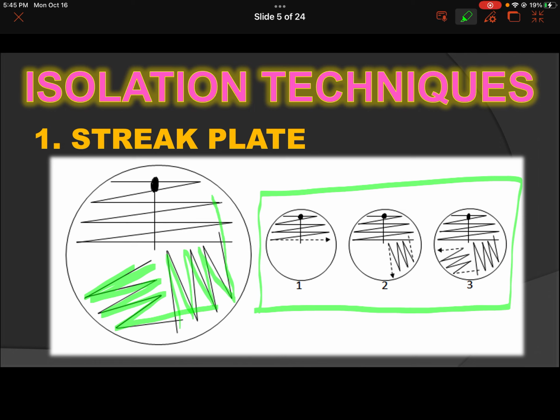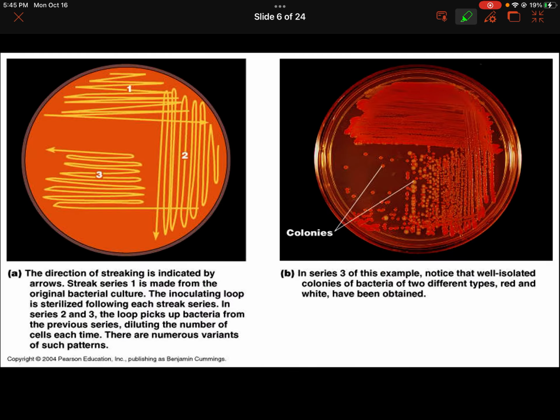If you do this correctly, because sometimes there are still areas on the third streak where the pathogens and other microorganisms are accumulated, you will know that you have done this correctly if you have obtained single colonies at the last streaking area. In the first streak, the colonies are concentrated, so you cannot observe the elevation, the color, the surface, or any morphological characteristics that you need for the identification of the bacteria.